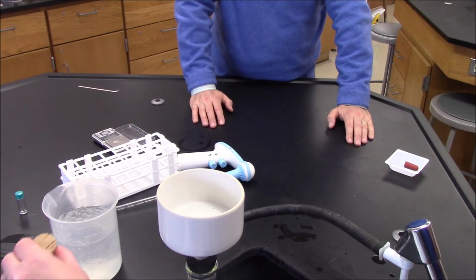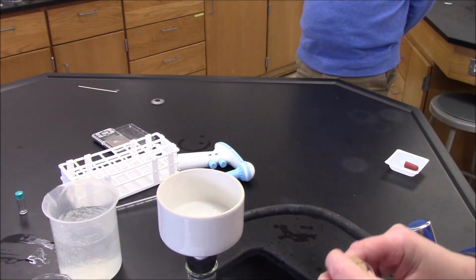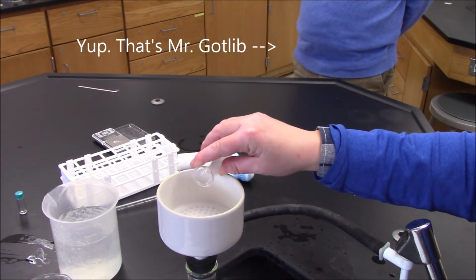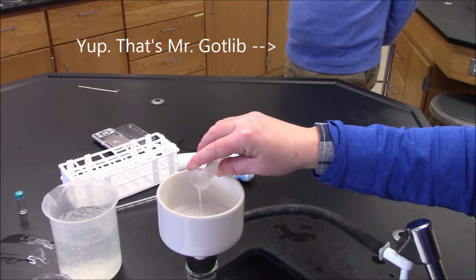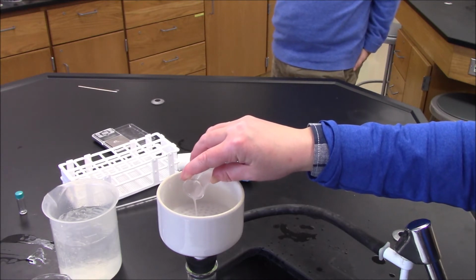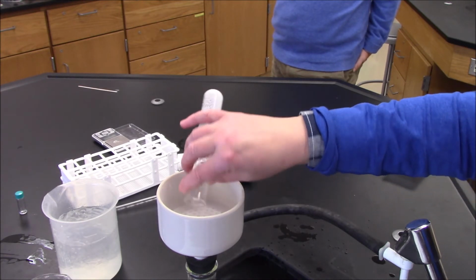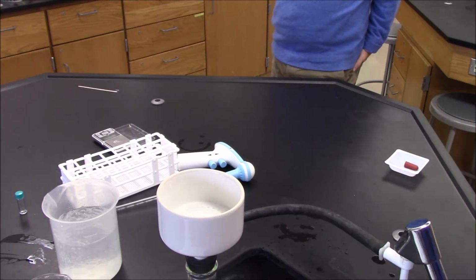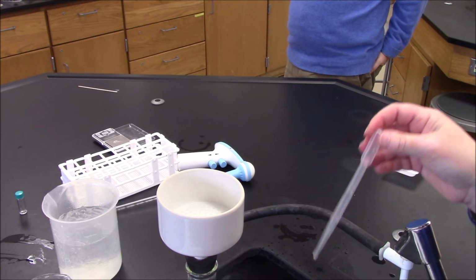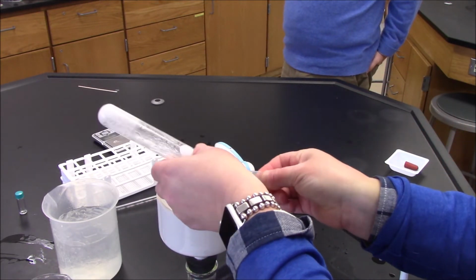Alright guys, I'm back here to do my filtration. I've weighed my filter paper ahead of time. It's 0.63 grams. So I'll slowly add the crystals here. Alright, now I'm going to wash them.